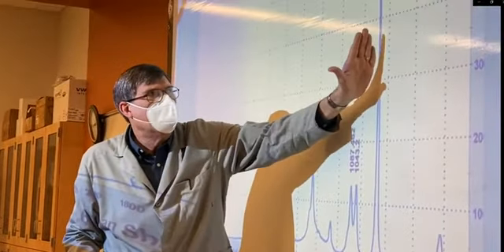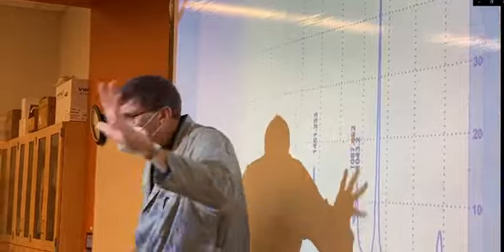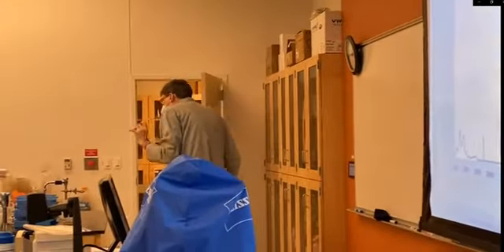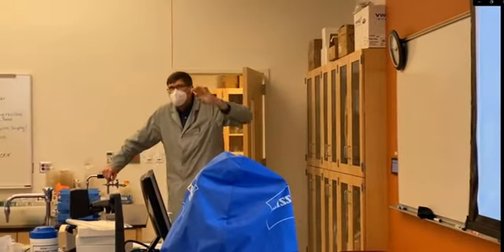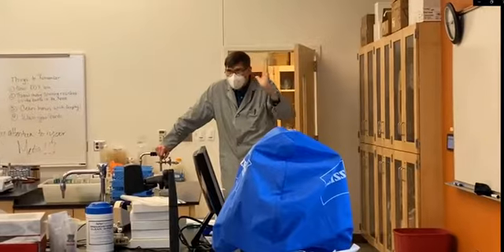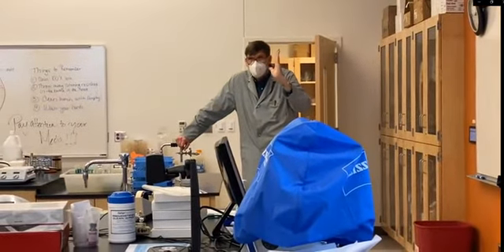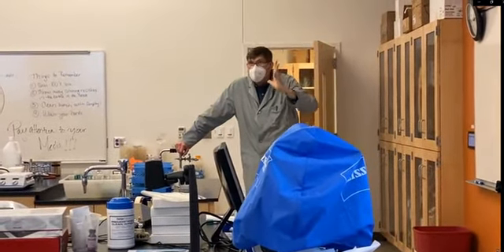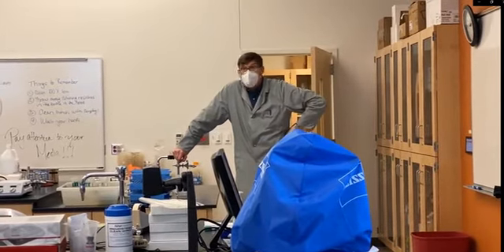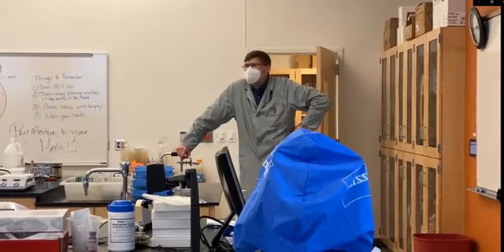So your peak may shift to like 873 or 871, but record the value that has the highest response, and what we see is perhaps a shift in that band just a little bit, the shift of the peak location due to the hydrogen bonding between ethanol and water when we're working with aqueous samples. Okay, I think that makes sense.